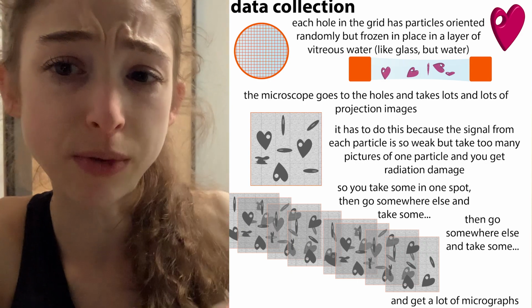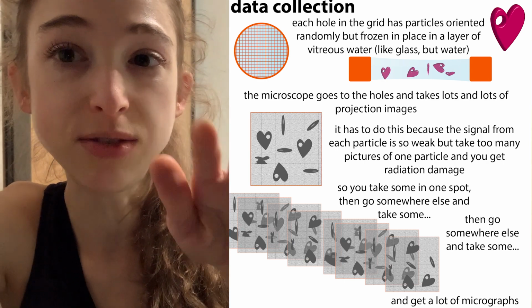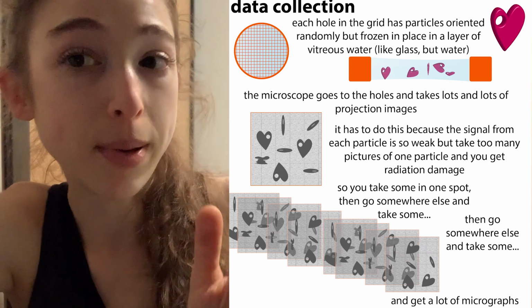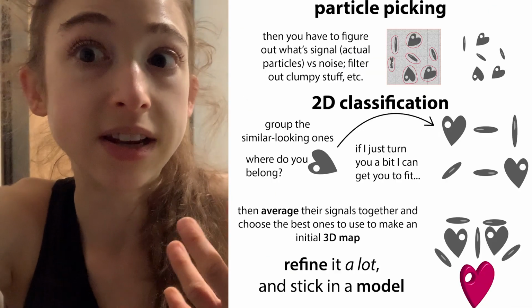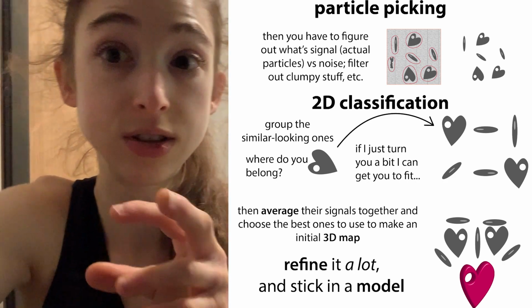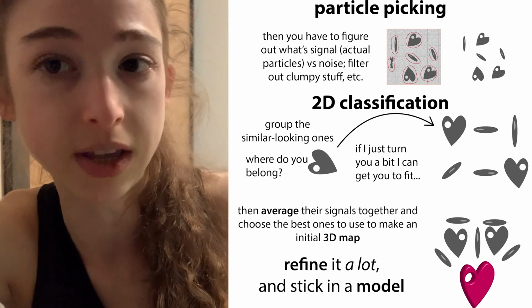What's going to happen is that when you get those images, basically the molecules are going to be in all their different orientations, and then you see something kind of like a shadow from where it was. And so depending on the orientation of the molecule, you're going to get different looking images. And so then it takes a lot of computational power to try to say, okay, well, which of these molecules look alike? Well, first of all, which of these is just crud, and what if this is actually your protein or your complex of interest?